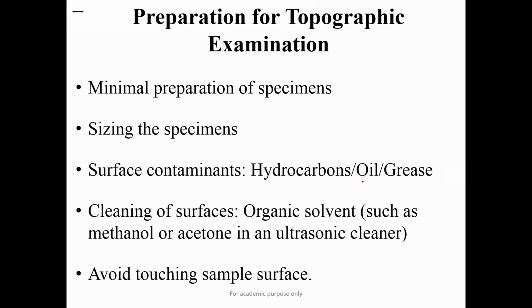The first thing is that in SEM, we need very minimal sample preparation. First is the sizing of the specimen, so that the sample can sit on the stage in the SEM machine. Second, and this is very important, it should not have any kind of surface contamination. Hydrocarbon, even if we touch our sample by hand, will spoil the sample. So once the sample is clean, we should avoid touching it.